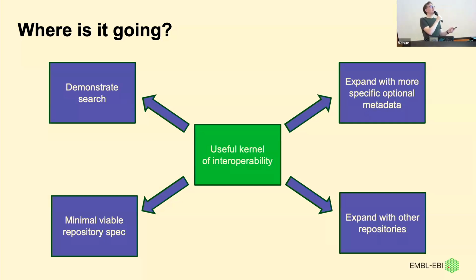We'd also need to think about where you go beyond minimally useful. When we were there in May, we talked about the NCBI taxonomy of the biological organism, and Jason made a big point: how do you distinguish between human tissue, a human cell line, and a human organ? These things are all really different. They absolutely are different, and we need to think about how we'd encode that, but you can't make cell line a mandatory field, because then the people doing tissue imaging will say this doesn't make sense. So we need to test this out, and there are ways to do this in linked data.